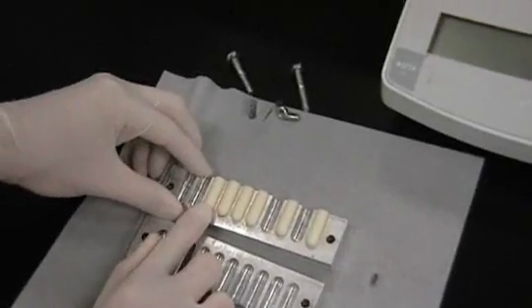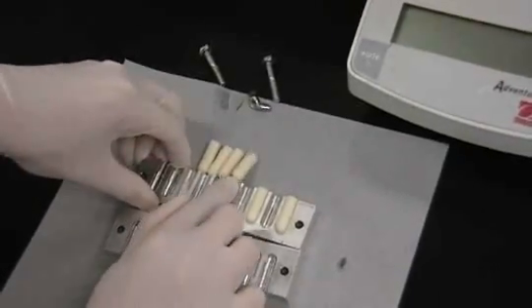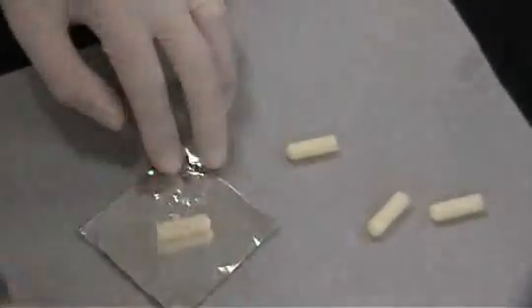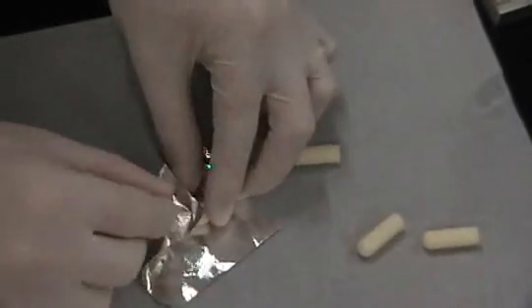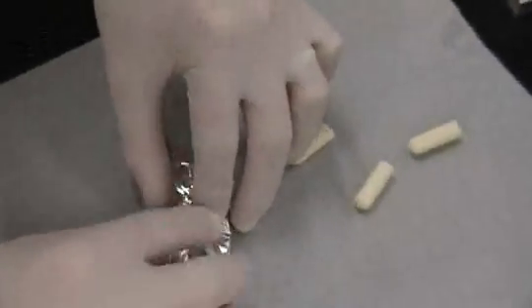Then stick the metal mold into the refrigerator for about 30 minutes for the cocoa butter, 20 minutes for the PEG. Afterwards, open up your metal mold and you're able to pop out your suppositories easily, as you see in the video. Once these are popped out, you're then going to wrap them in the foil. Be sure to wrap them very tightly and neatly so that the actual suppository shows pharmaceutical elegance.